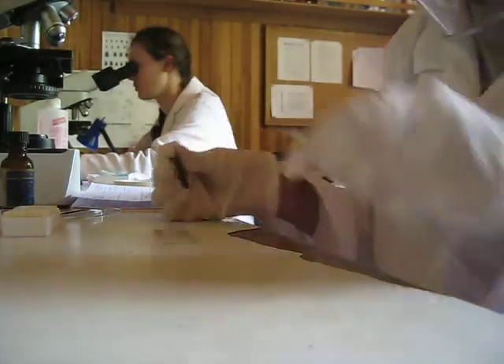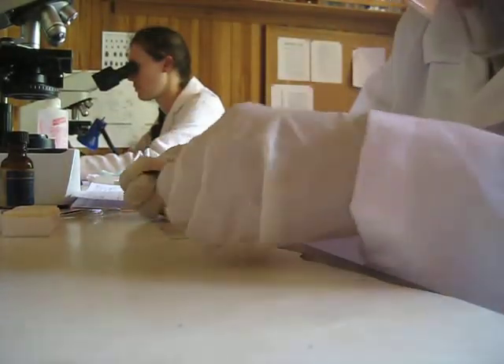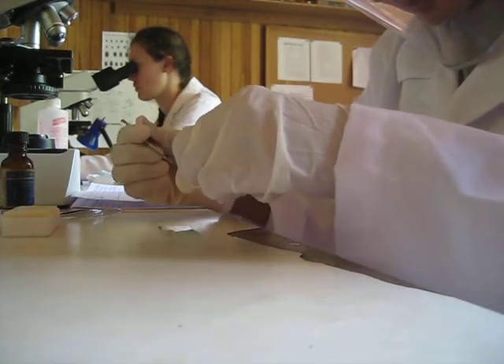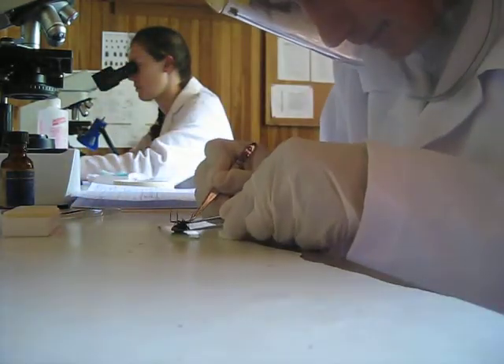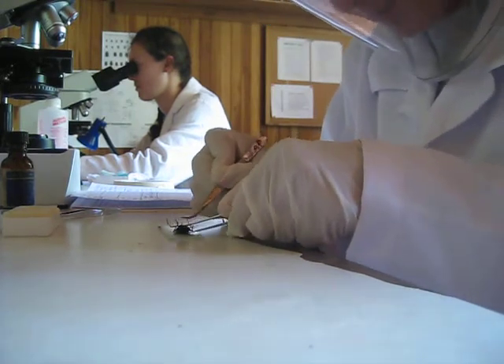This is an adult. It has wings, so you need to be very careful with it or it can get away from you. So you hang on to it by its thorax, excuse me, and you massage its abdomen from top to bottom.